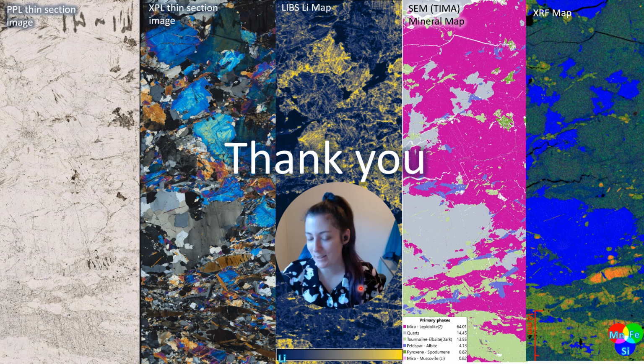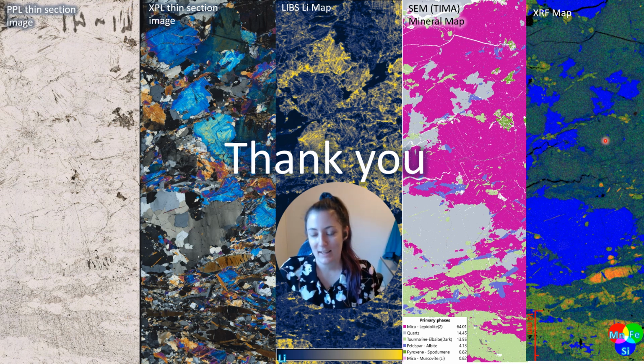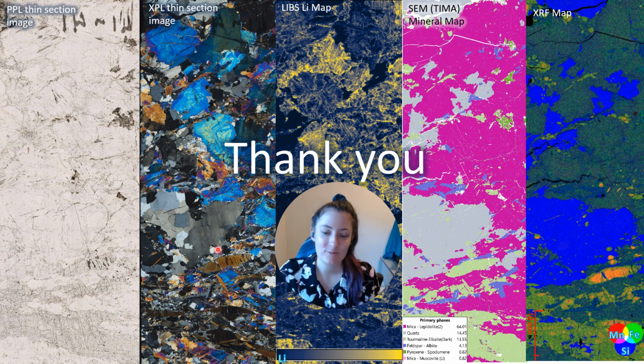So thank you for listening to this very short little talk about optical petrography in geology. Here's a little example of the same thin section that was taken with plain polarized light, cross-polarized light, laser-induced breakdown spectroscopy, scanning electron microscopy, and automated mineralogy, and also X-ray fluorescence. So you can have a bit of a see about all the different techniques and how optical microscopy is the most beautiful. Thank you.